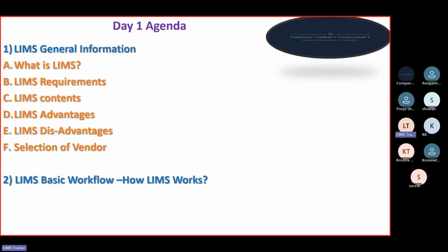Okay, so that is the position he will have as a LIMS consultant in the IT industry. Again, there will be two kinds of projects a software consultant will work upon. The first one is the implementation project. The second one will be the support project. Okay. So, what is the implementation project?